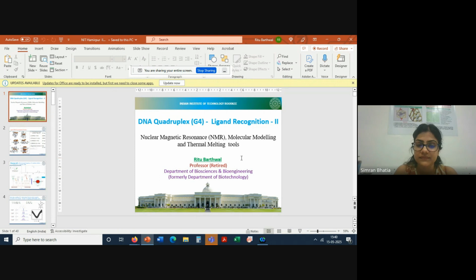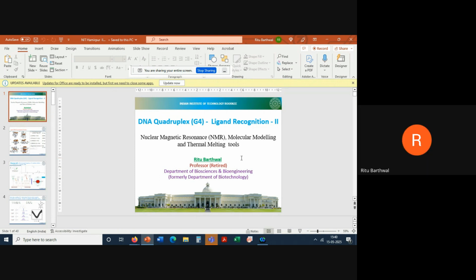Thank you, ma'am. Yeah, I'm now going to tell you about DNA quadruplex ligand recognition, the second part, using some sophisticated techniques. Earlier, in the first lecture, you have already been introduced to quadruplex DNA and its importance. Then in the morning lecture, I had told you about simple techniques like absorption spectroscopy, fluorescence, circular dichroism spectroscopy, and some other techniques, how to recognize a ligand, which is generally a small molecule which binds to DNA quadruplex.